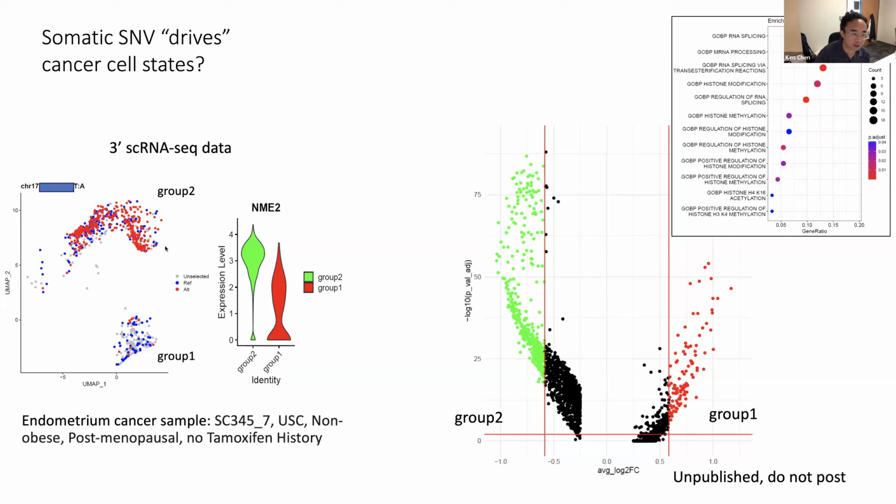Actually, gray are the ones that have coverage lower than we're able to analyze. Those are kind of no reads. Yeah, the gray are actually zero detectable reads in the cell. So those are no call. Okay. Thank you. Yeah, so we're trying to delineate those with data and without data.